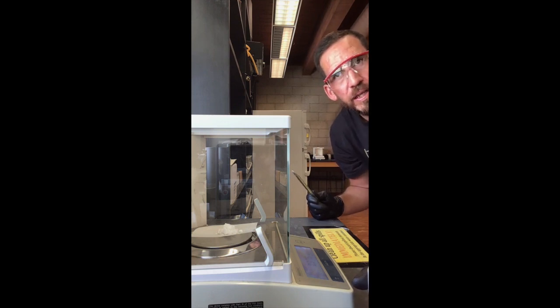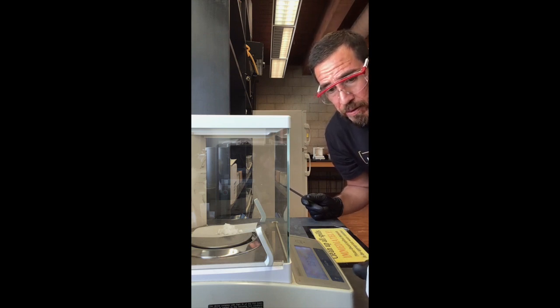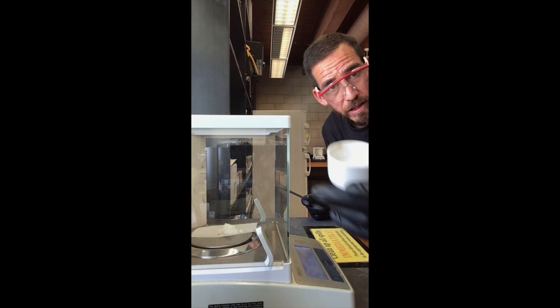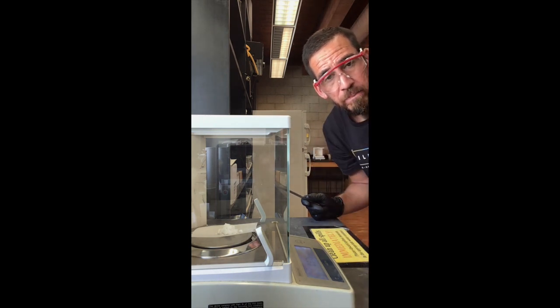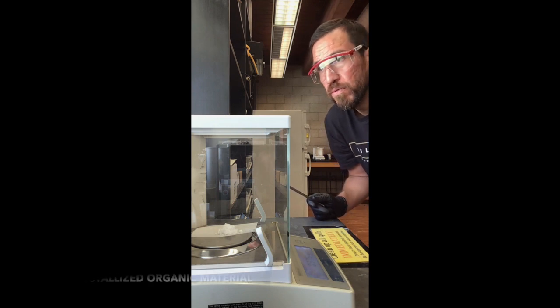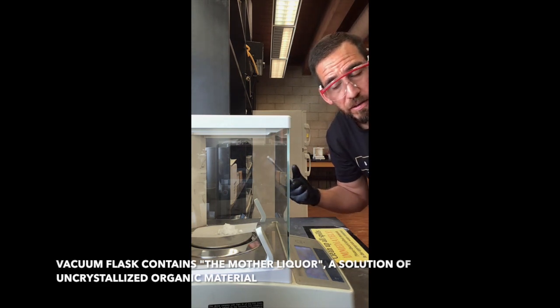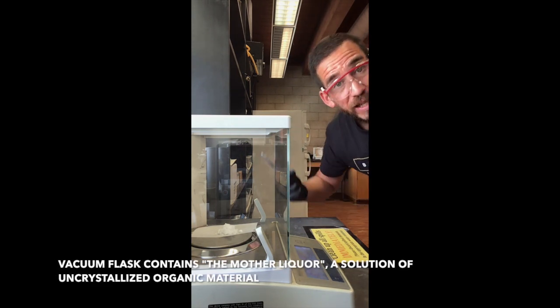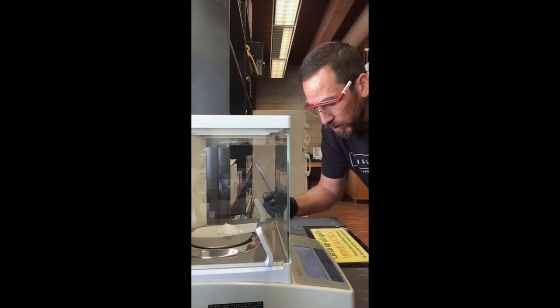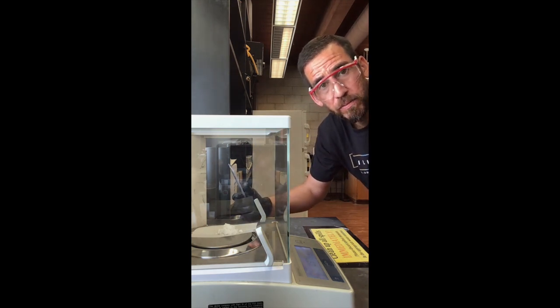So that's just another thing that we have to deal with when we are transferring materials from one vessel to the next. Now, one thing I want to mention is, if we wanted to maximize our yield, I can just take some ethanol, dissolve it in here, go back to that vacuum flask, dissolve whatever's in there, or whatever was left in the recrystallization flask. I can recapture all of that material, dissolve it in ethanol, and then recrystallize it again to maximize my yield.